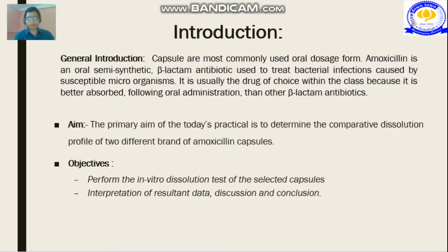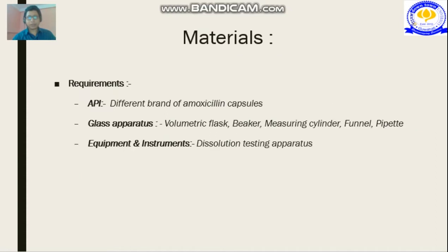of amoxicillin capsules. To do so, we have several objectives: to perform the in vitro dissolution study of the selected capsules, followed by the interpretation of the results, data and discussions. Then we are going to interpret the data and give the conclusions. Now let's see the materials at a glance.